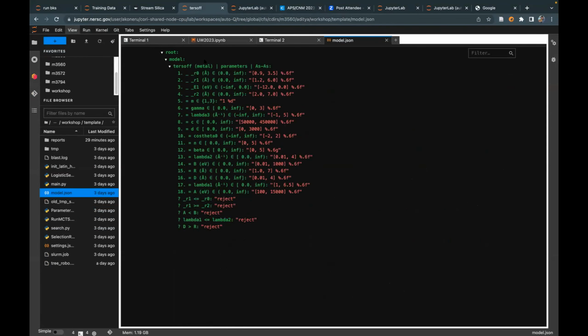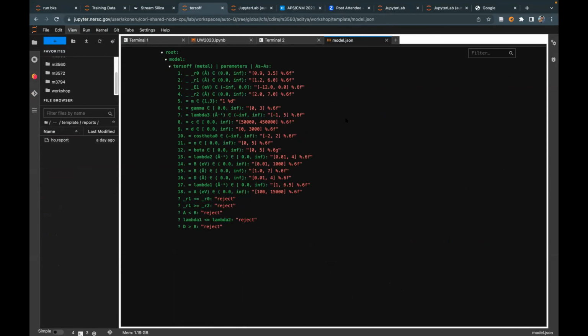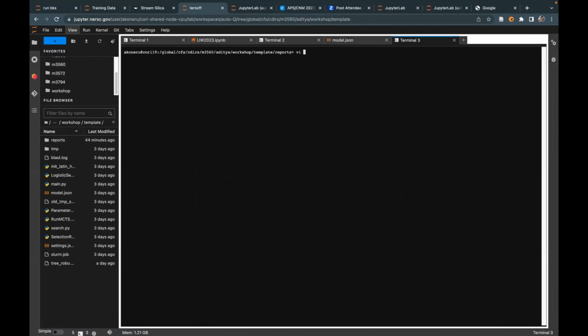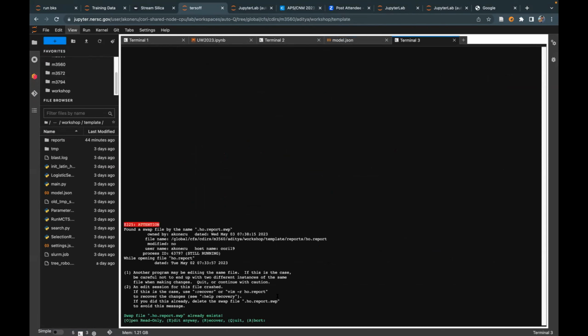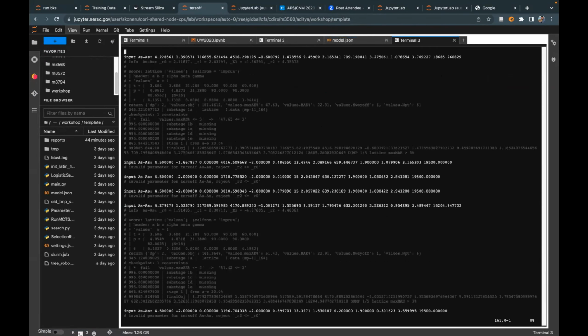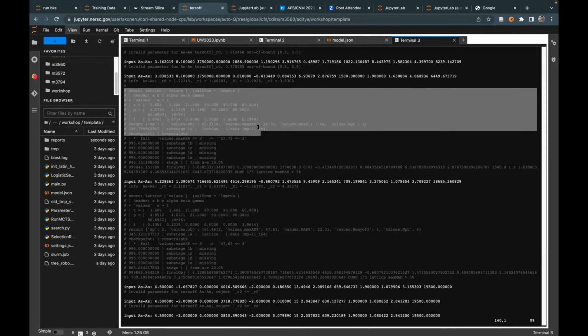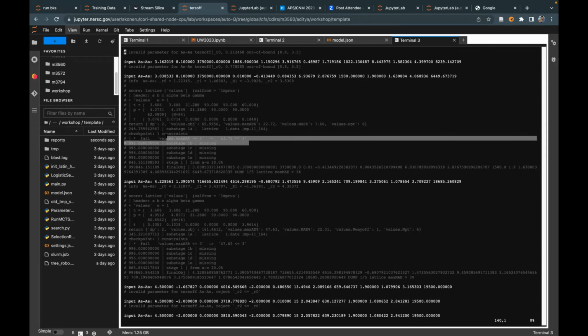As we are running the fitting, we have multiple outputs, a few of which I have shown you across the Streamlit interface, but we do have this report file from which I am post-processing the data, where each stage, say for example the lattice stage, is computed, the target and predicted values are noted down, and also the score or the error criteria. All the data is in here.